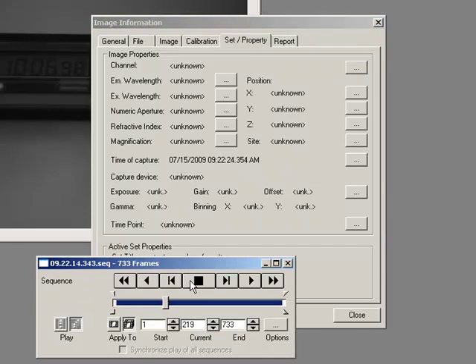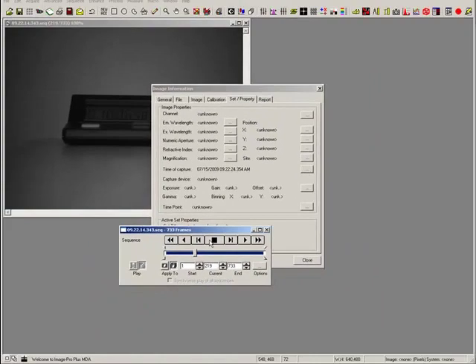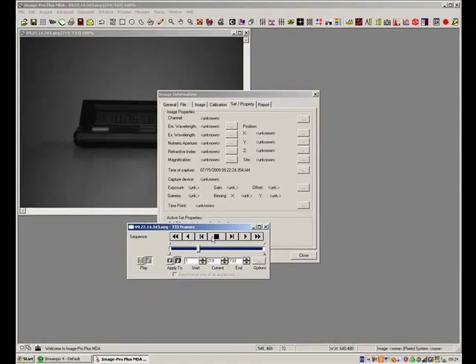One of the nice things about StreamPix is the interframe time is pretty tight. With a lot of other packages on the market, when you're trying to take an image between frame 1 and frame 2 and 3, you'll get a different interframe time, which isn't particularly handy when you want to do proper science. But here is my movie, 22 frames a second. Export it into Image Pro or export it out to AVI or whatever you need it to be.